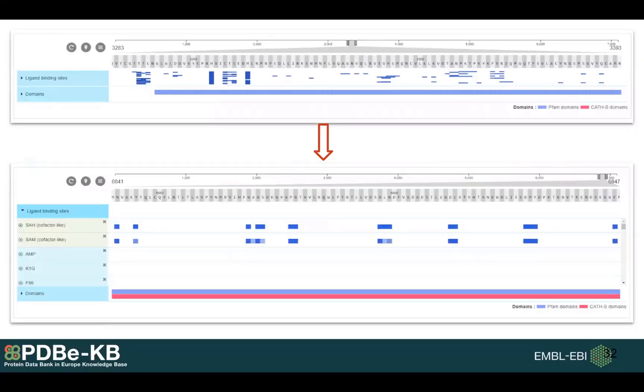Underneath this gallery we have a sequence feature viewer called Protvista. You can use this to actually look at the residues which are interacting with these small molecules. One of the features I really like is that if you collapse the track for the ligand binding sites, then you can see patterns.